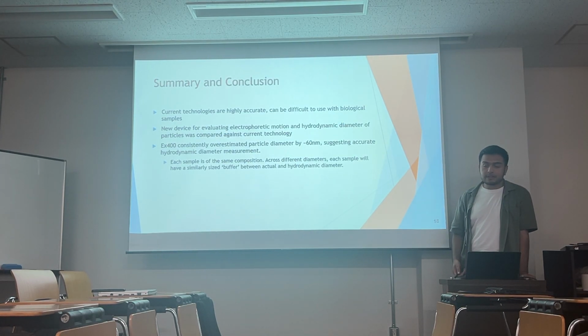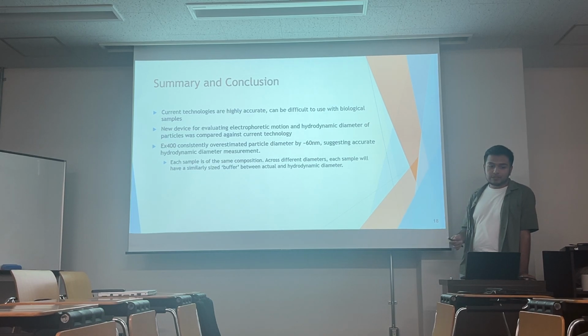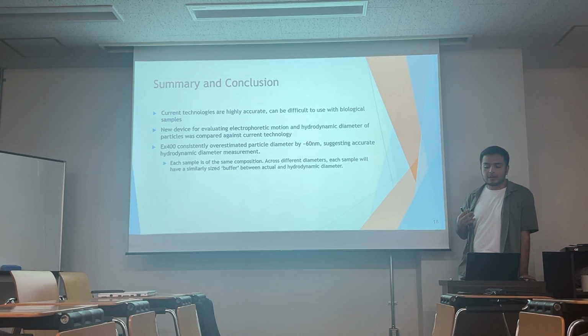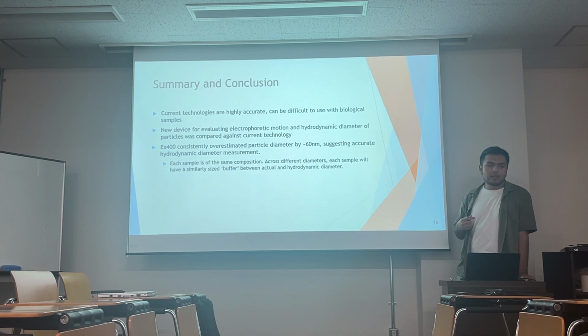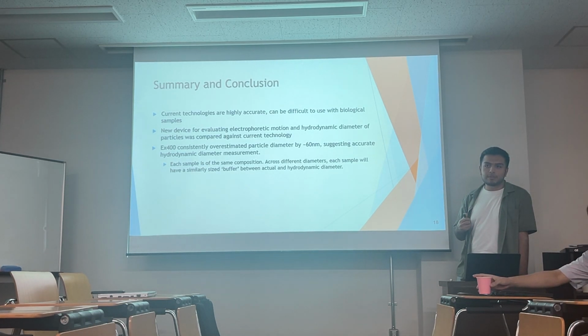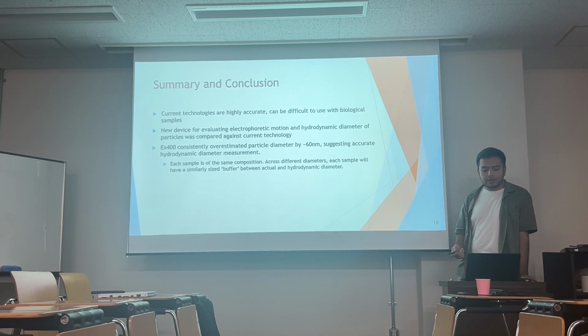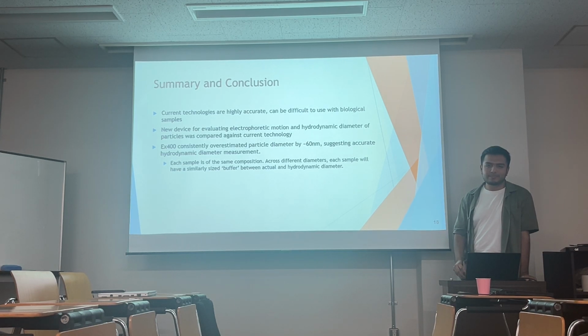So a quick summary and conclusion. Current technologies are very accurate, but they can be difficult to work with in a biomaterial context. There's a need for new devices to be developed to make it easier to work with biomaterials. We developed the EX400 and we found it to be accurate at measuring hydrodynamic diameter at different diameters.